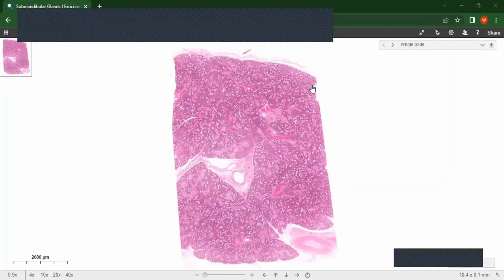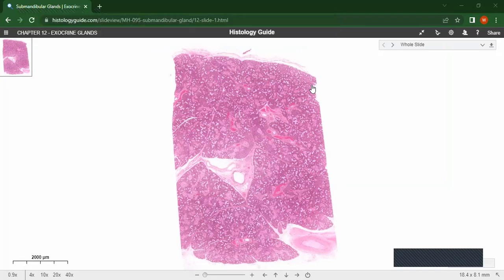Welcome. Today we will be looking at the histological organization of the submandibular gland. The submandibular gland is one of the major salivary glands. It is a seromucous gland, meaning that it has both serous and mucous acini.